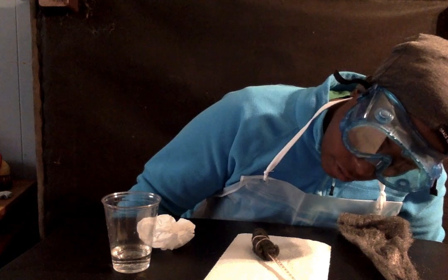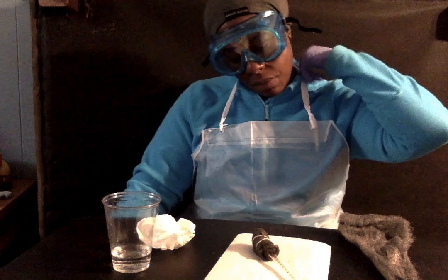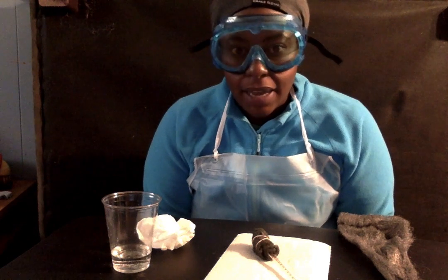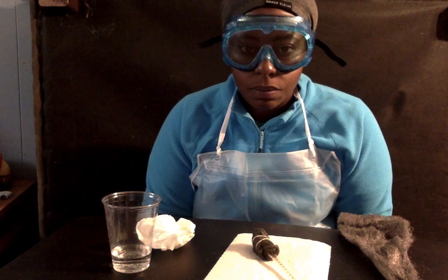Okay. About 5 more seconds, and then we can record the initial temperature. Okay, so after 1 minute that we've clocked, it was at 30, it's now at 40. So we've already seen an increase of temperature to indicate that there has been some change. In some of the other experiments that we did, we definitely learned that something that's going to indicate a chemical change is an increase in temperature. And from this experiment so far, you're already seeing that happening just after the first minute. We're still going to go ahead and let the timer go. And then at 10 minutes, I will photograph my observation. And we'll compare it to the wool we have here that was not submerged in vinegar.